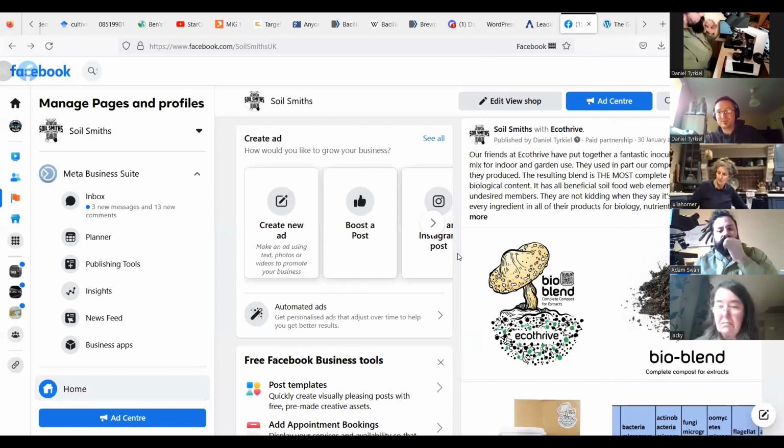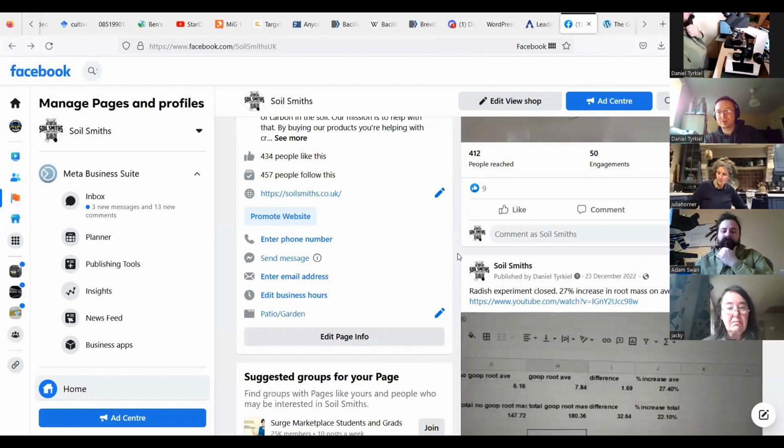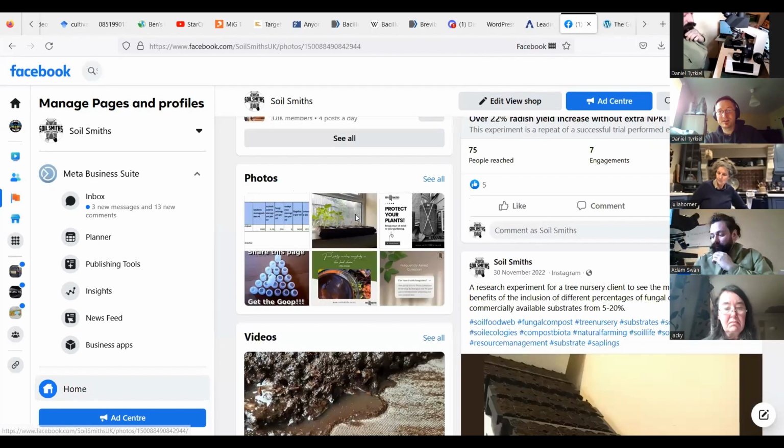There's quite a few really nice people who are trying to. Oh, finally found it. Yes, these are my. If it opens.